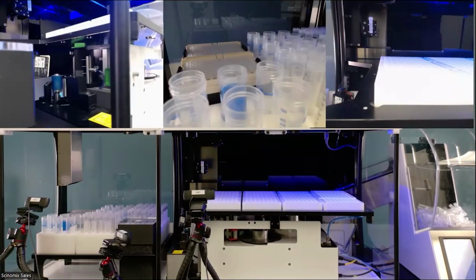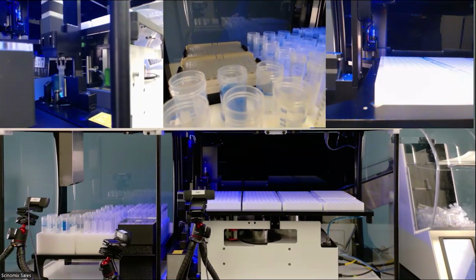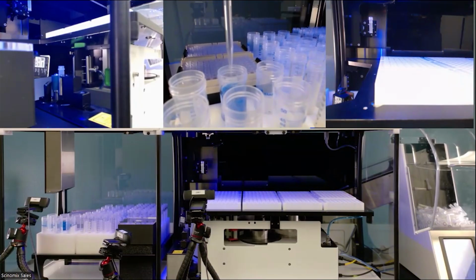Okay, so the system is starting right now. We're going to see a tube being bulk fed in. These are going to be those capped and empty tubes that are your destination tubes. First, our robotic gripper is going to uncap the tube. Right now, the single channel pipette is doing a liquid level detection to find the liquid surface. Once it finds a liquid surface, you'll see it aspirate.